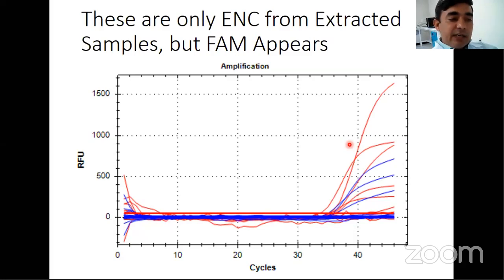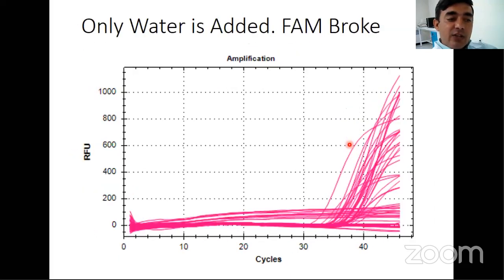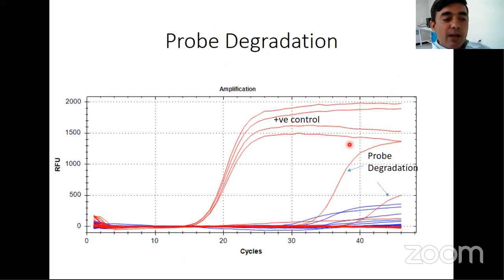So the take-home message from this slide is that probe breakage issues may appear, and to address this type of issue, we need to check our system properly and periodically. We should not rely on one particular kit without validating it, without properly checking it, without periodically checking it. So we periodically check all of this system, that whatever stock we have is working finely and good.